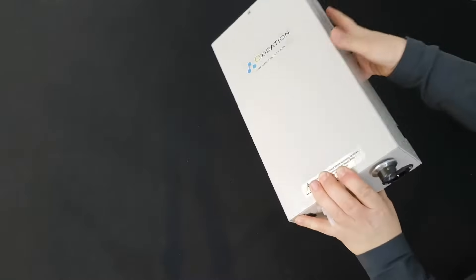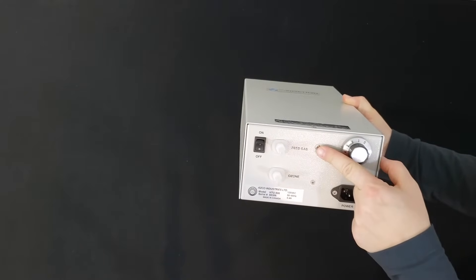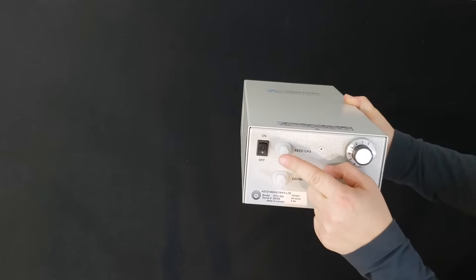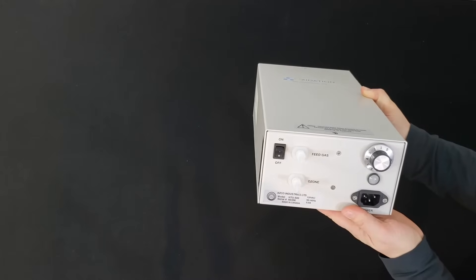The standard HTU 500 requires a feed gas to produce ozone, which is supplied via the inlet — a Kynar barbed fitting that fits a quarter-inch ID tubing.